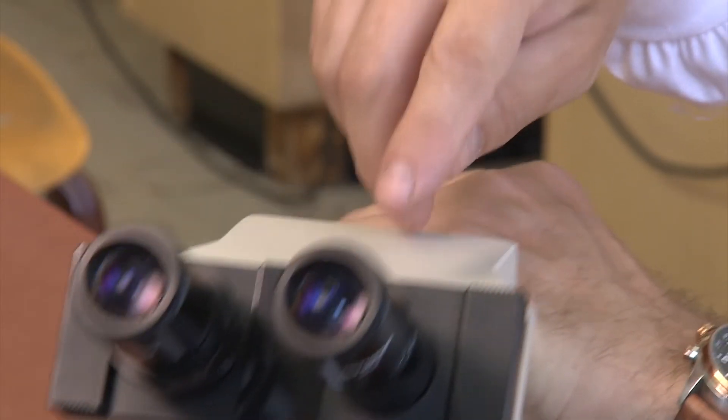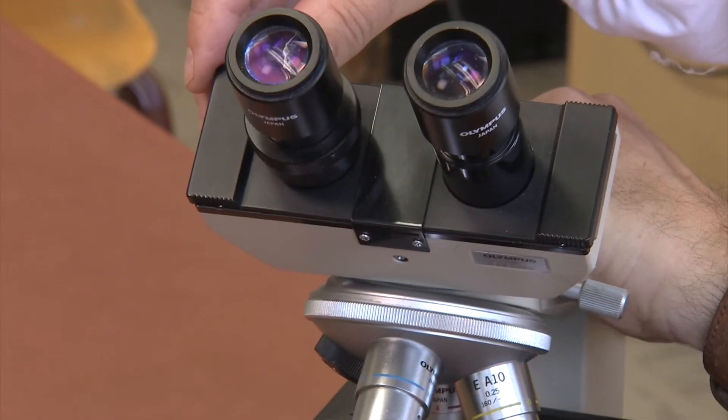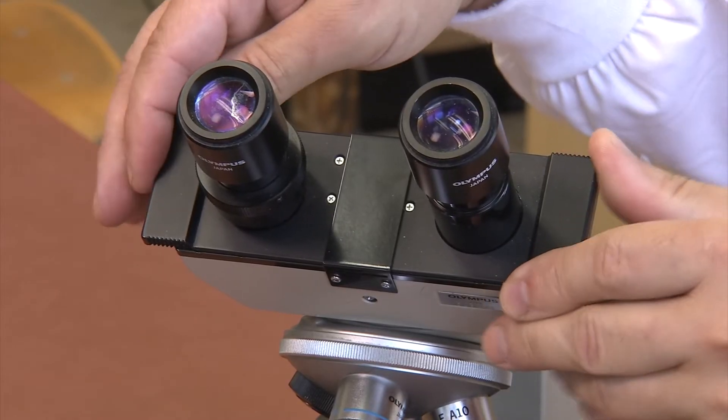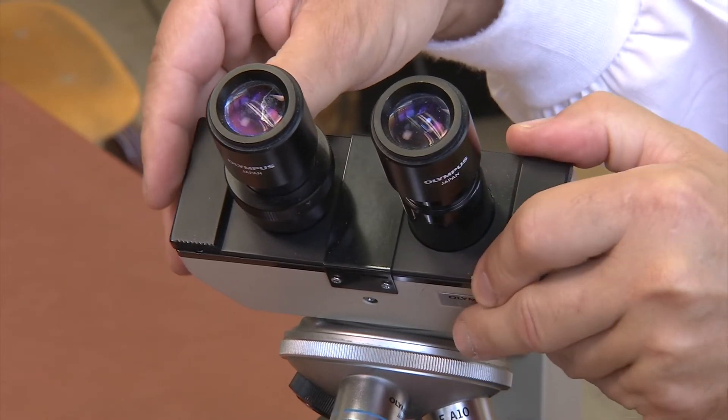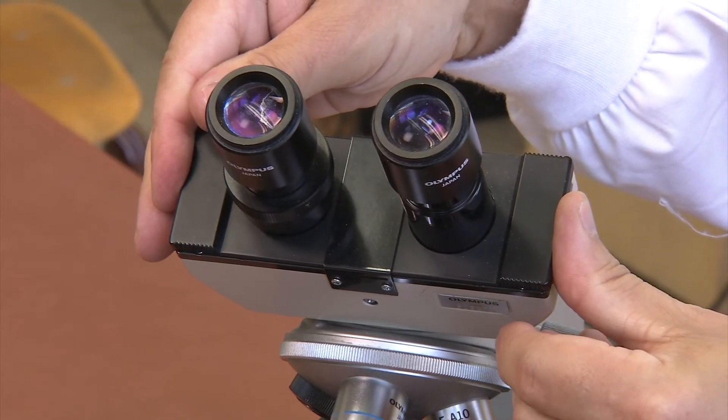Between the base of the oculars is the interpupillary distance scale. It resembles a ruler because it measures the distance between the oculars. The scale will help you consistently set the distance between your oculars every week. To change the distance, simply move the oculars together or apart.